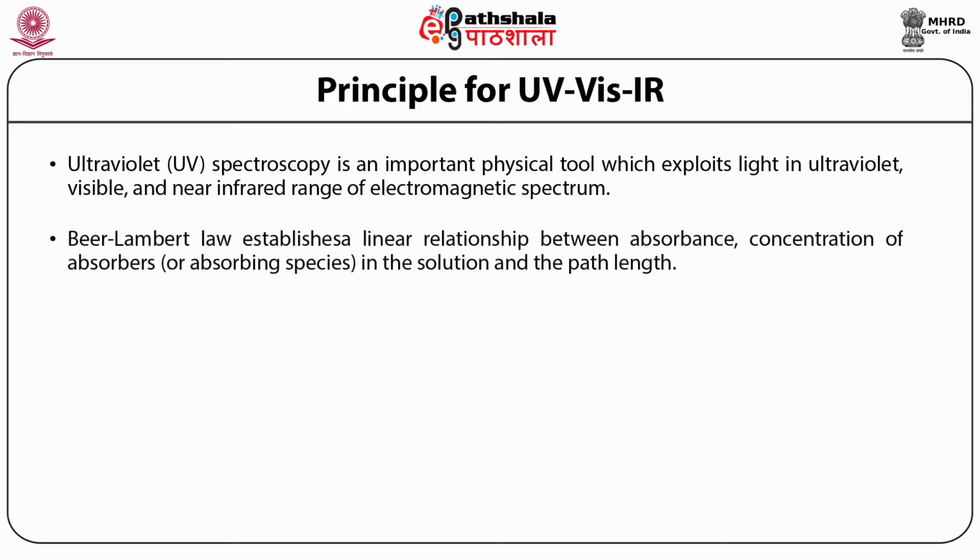The Beer-Lambert law establishes a linear relationship between the absorbance, the concentration of absorbing species in the solution, and the path length.